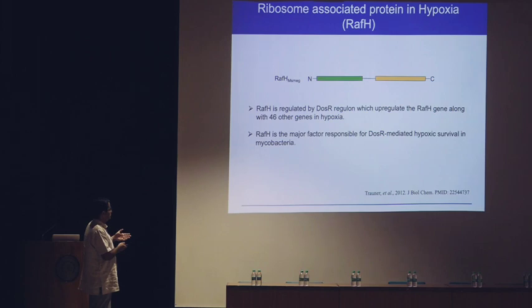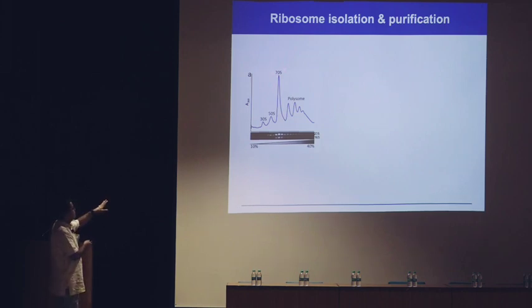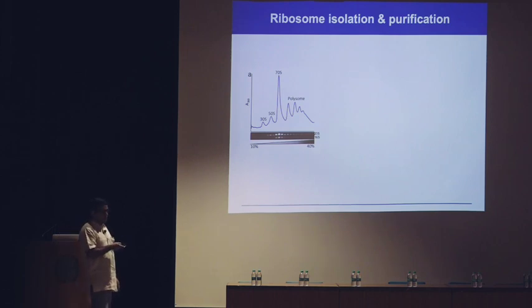Okay. So then obviously we started the cryo-EM. For that we need a ribosome. My student Neeraj and Shivani, they purified the ribosome. And this is the 70S. This is a sucrose gradient ultracentrifugation after fractionating. You see this peak, and you can see both ribosomal subunits are there, ribosomal rRNA. This is 50S, 30S. Problem was, we tried, but we failed.